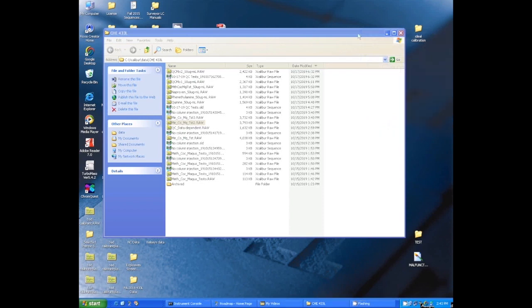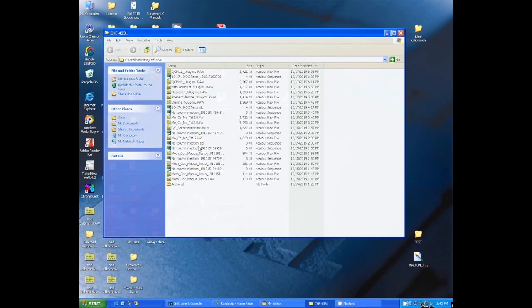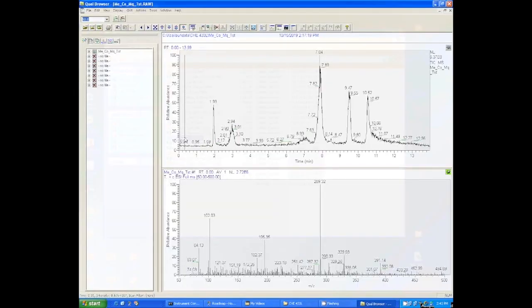When you're ready to look at data, you can just go to that file and double-click on it, and it should open up in the qual browser. In this qual browser you're going to have two windows. The top is the chromatogram, the bottom is the mass spectrum.